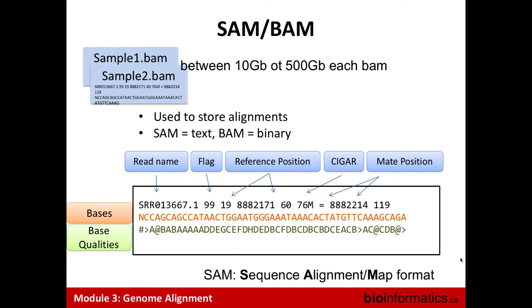I was referring more to that 60. The best quality, the mapping quality. For the mapping quality, the worst is 0, which means I cannot map. Sorry, the arrow seemed to point to that number. Yeah, sorry. And the 60 is the best? The maximum depends on each aligner. So 60 for BWA is the best. For STAR, for example, if you do RNA, it's 255.